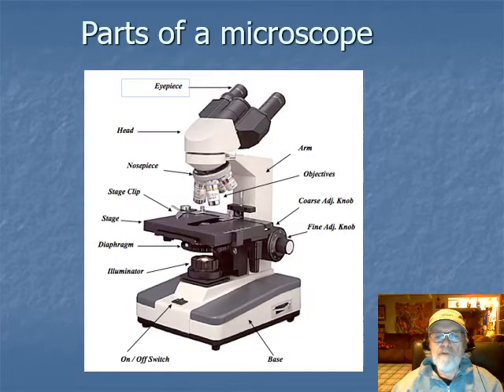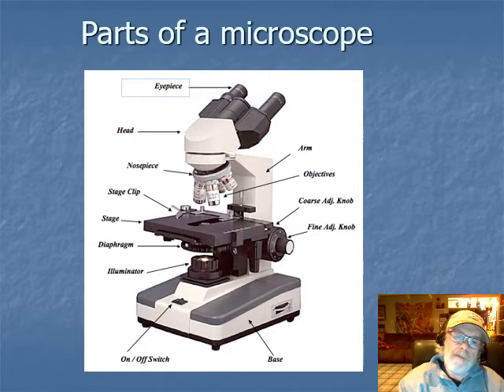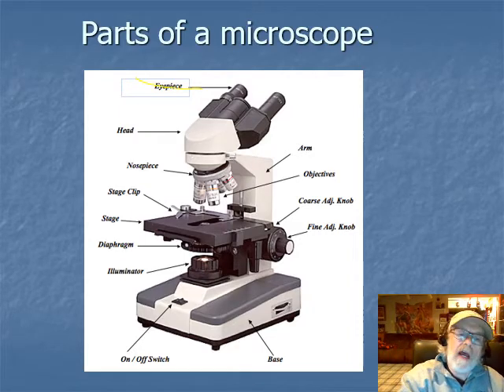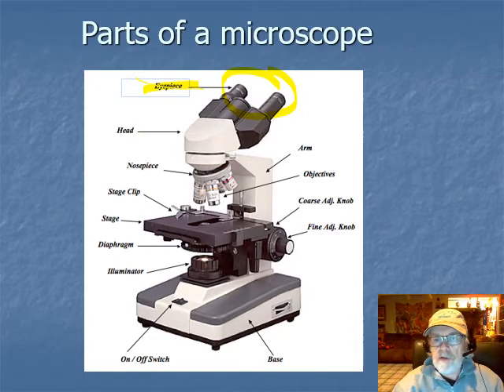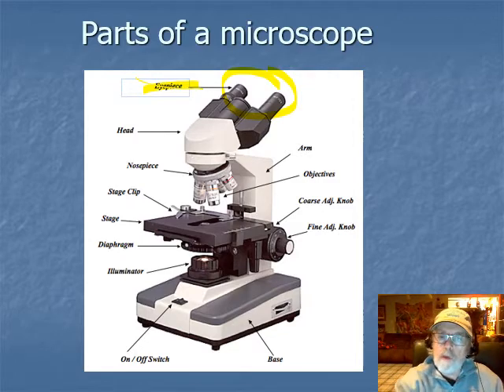Probably the first thing you need to know is the parts of the microscope, because they all have a special purpose. Let's go over these individually. This is the eyepiece - that's what you're going to look in. This is a binocular microscope because it has two eyepieces. There is monocular with only one tube to look through; this has two.